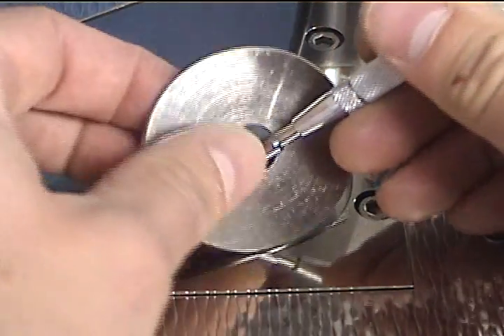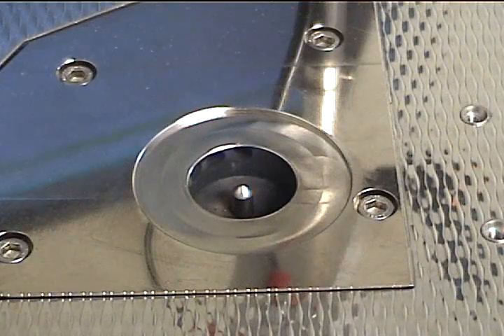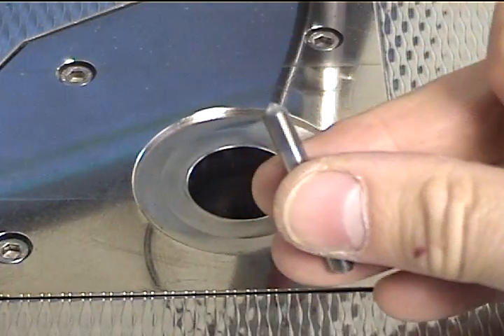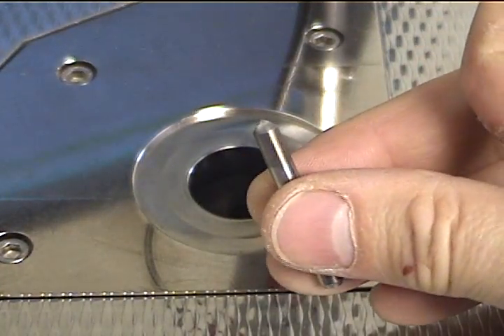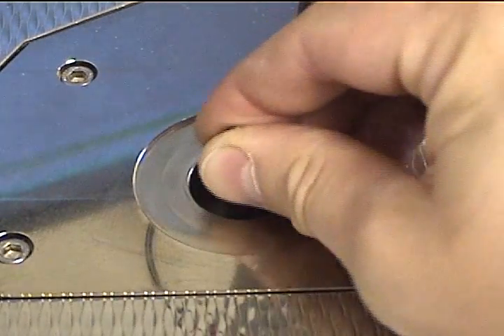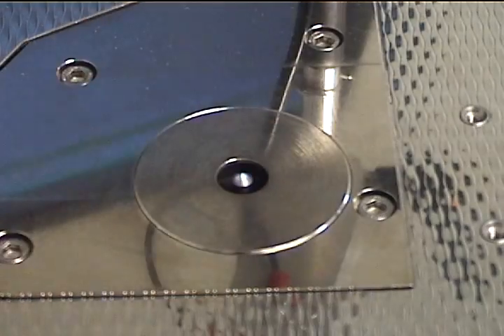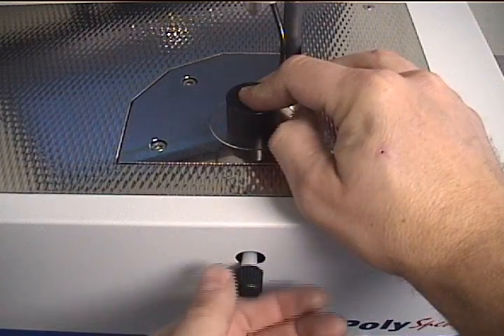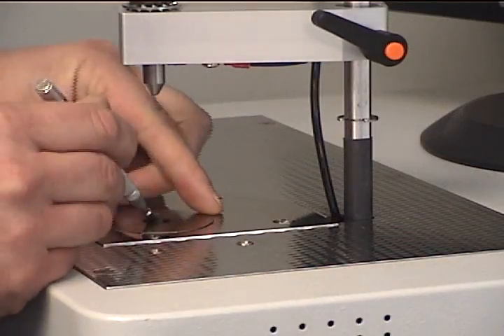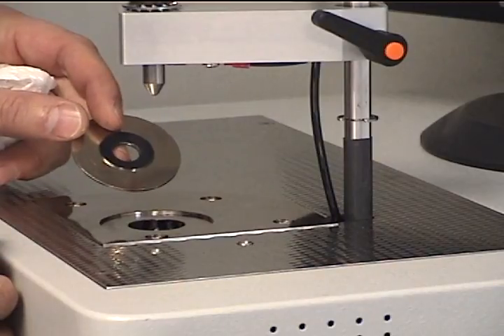Maintenance of the PolySpec is very easy and takes only a few minutes of time each day. The most important area is underneath the spark plate, which contains the tungsten electrode. This should be removed and inspected for sharpness each day. After the electrode has been inspected or sharpened, it is replaced and set to the required gap using the supplied gapping tool. The sample plate should also be periodically removed and the underside cleaned with a soft cloth.